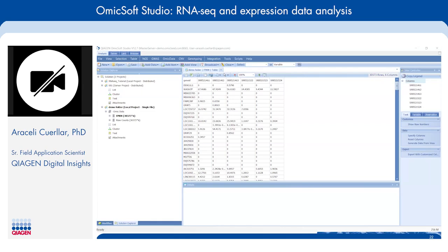And so you can then add what type of analysis you want to perform, whether you want to take a look at all of your genes or maybe certain genes, all of your samples or certain samples. And then here under other options, you can select the number of components that you want to analyze for your PCA. And so in this case, we can select that we want to do 3 components.